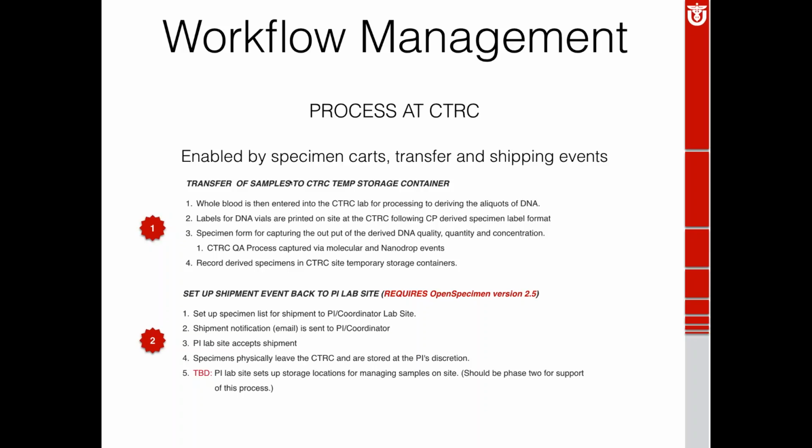We're working on some requirements on actually building a custom report that will print out essentially a batch of the samples that were dropped off, with either generating an ID or something like that that can then easily be scanned. Then you get a list of the samples that come up. Of course, that's a future thing we'd like to see happen. Right now, we're just going to have a CSV export, and then probably just build up a quick little report in Excel or something that generates a barcode there so that people can scan them in quickly when they pull them off the shelf to be processed.